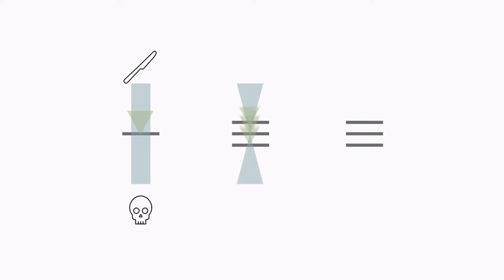So how do we get around that? Well, traditionally, if you want a section image, you have a sample, different planes that illuminate light. Take a knife, you cut it. That's called sectioning. It's deadly. So that's not useful for us. You have other options to use. The most prominent one is probably confocal microscopy. You take a single point of illumination, and then you have a focal conjugated spot that blocks all the light. And it works, but it's quite slow.